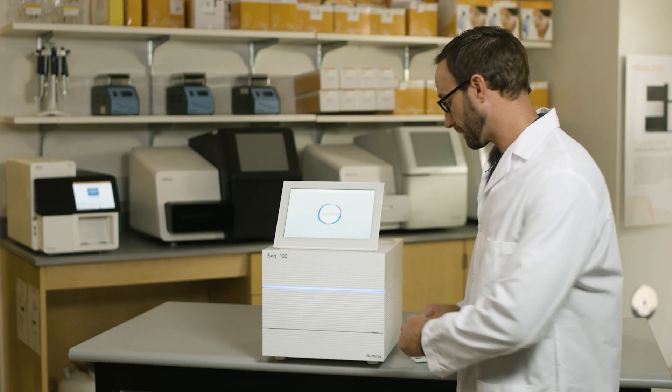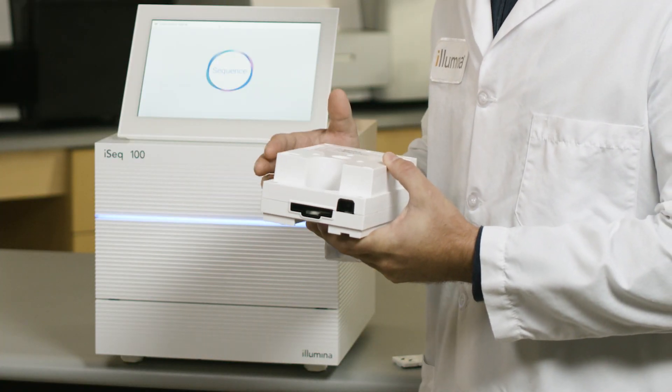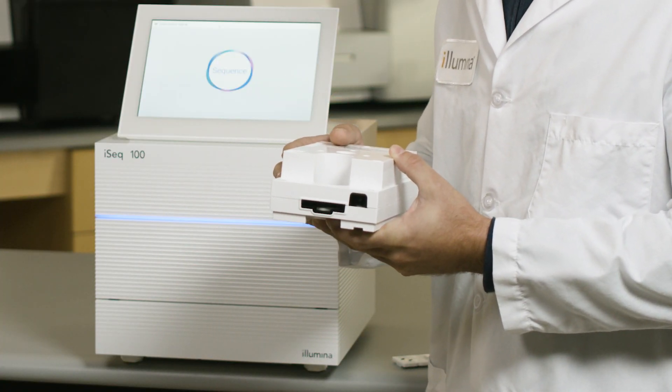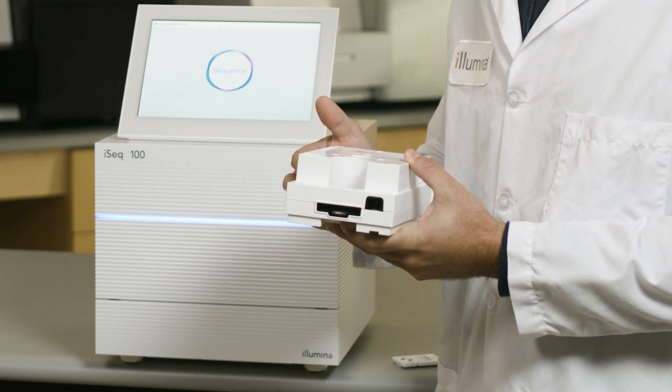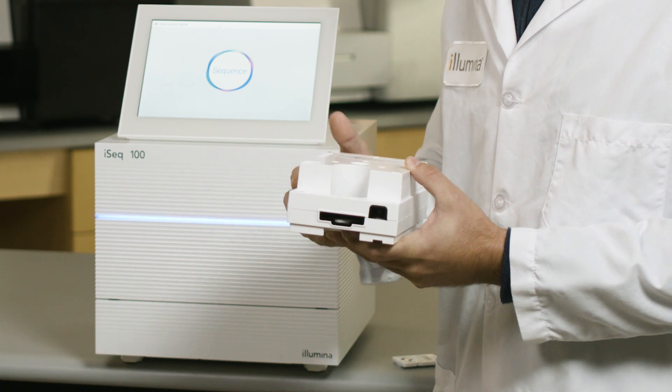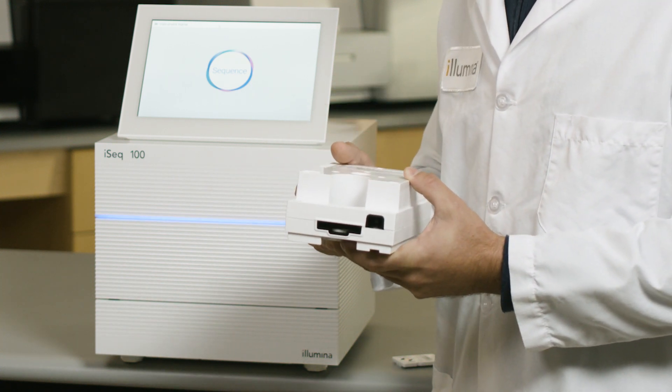We'll start with the cartridge. The cartridge, which has all of your frozen reagents, will be shipped on dry ice and stored at minus 20 degrees. It can be thawed in the refrigerator overnight for a run to be started the next day. Or, it can be placed in a room temperature water bath in its storage bag just a few hours before the run.